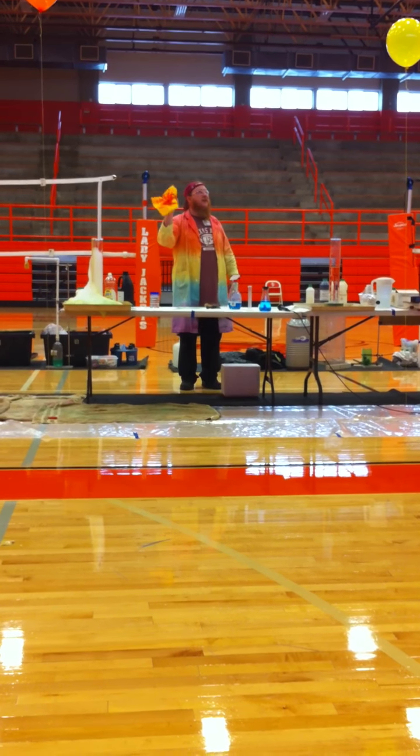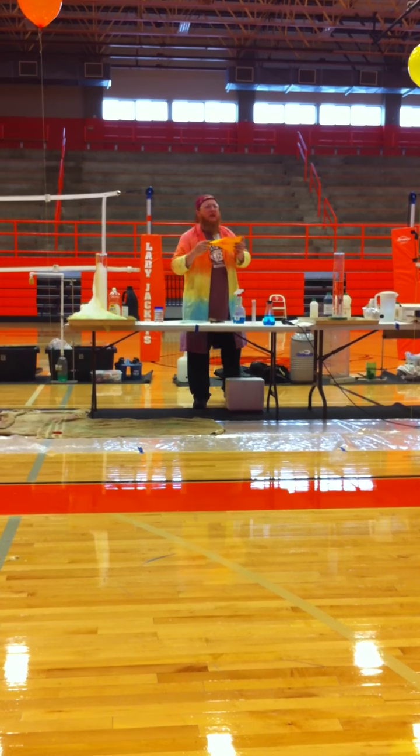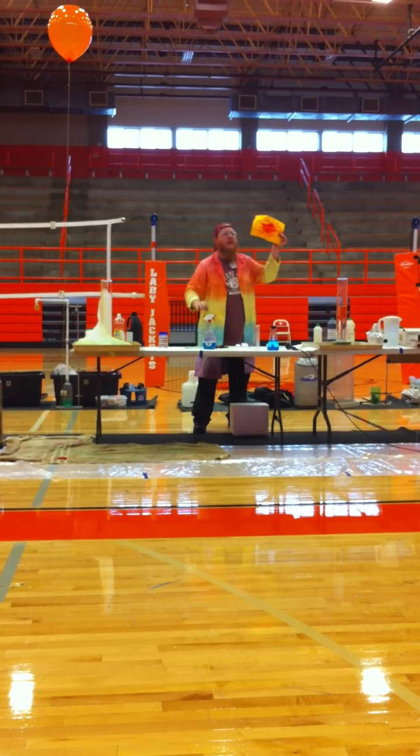Yeah. Now I like you guys, but I'm not going to bleed for you. Sorry. So what happened here? This is just ammonia window cleaner. Nothing special there. The special thing here is the paper.